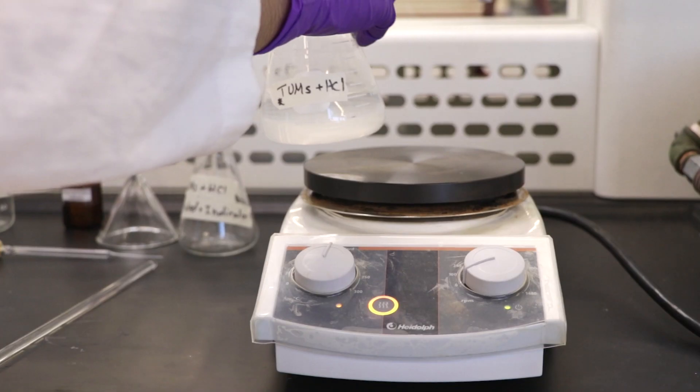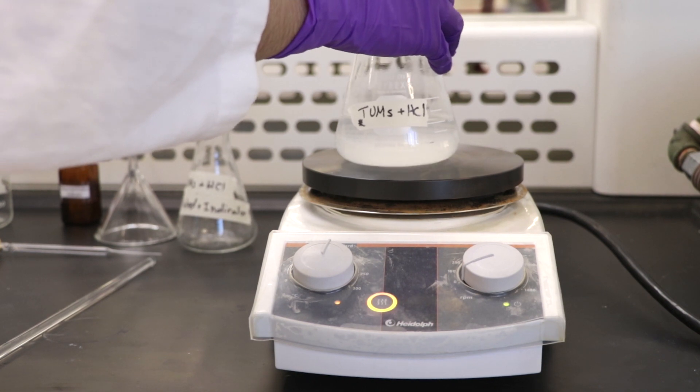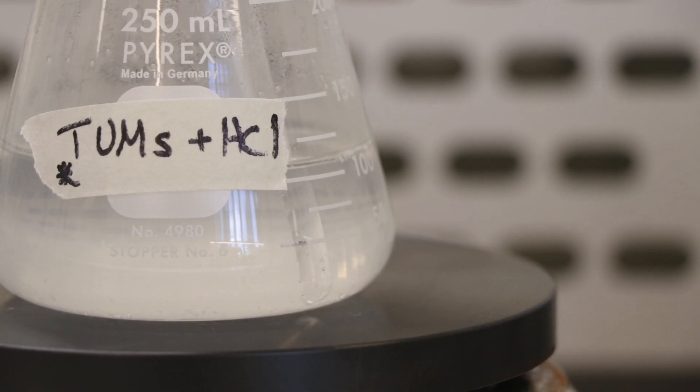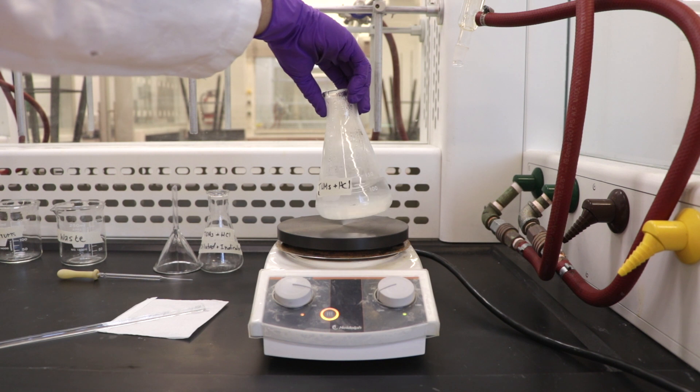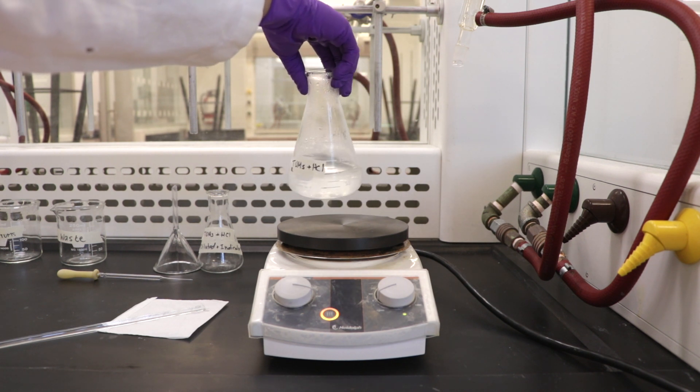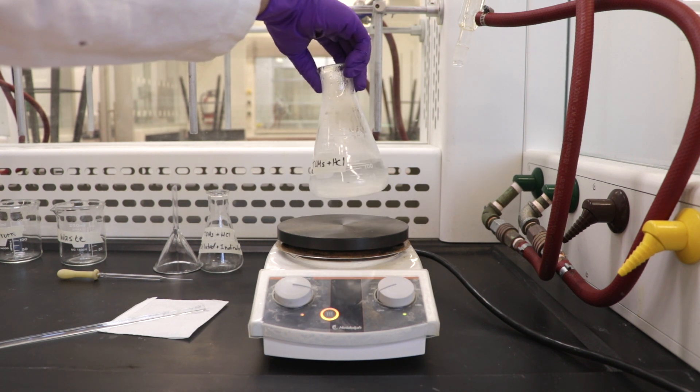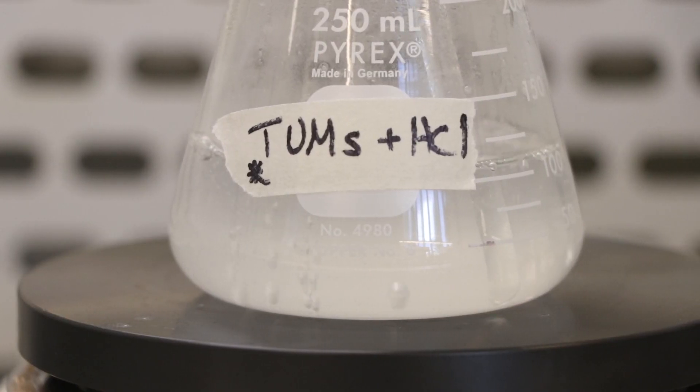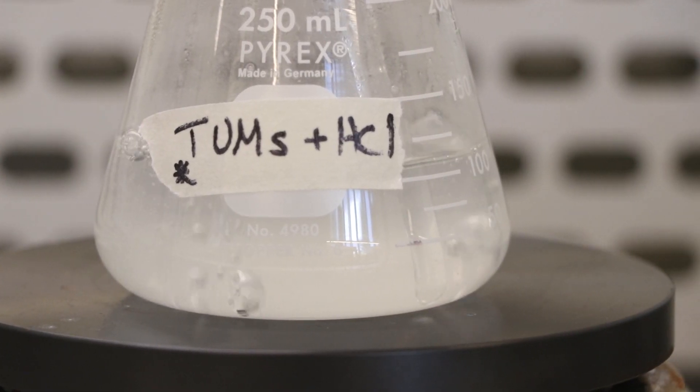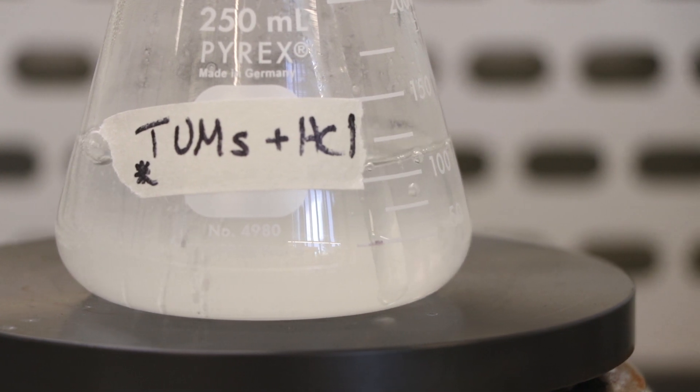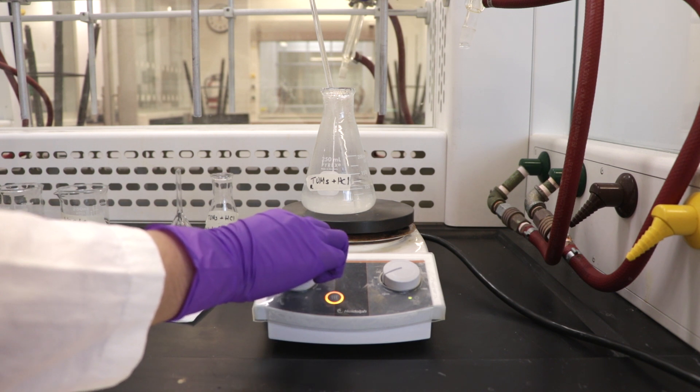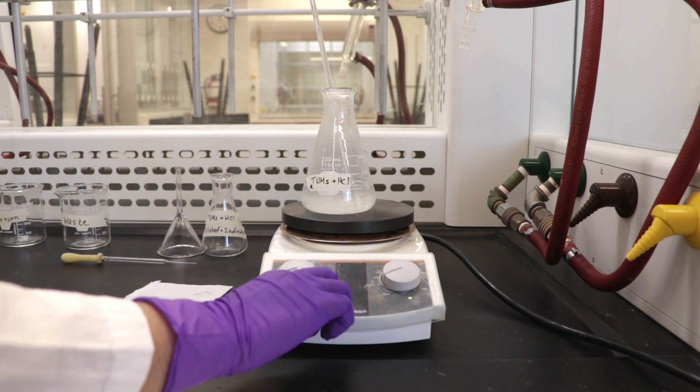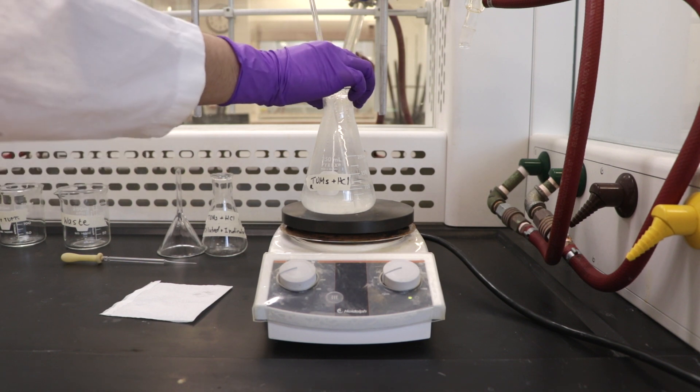Place the flask on the hot plate and heat to a gentle boil for five minutes to remove the dissolved carbon dioxide. Dissolve the tablet as much as you can. Try swirling the flask or breaking the tablet with a stirring rod. The tablet has insoluble binding material, so you may not be able to get everything to completely dissolve. If any film forms along the side of the flask, wash it down with a disposable pipette or a wash bottle. After five minutes of boiling, set the flask on the bench to cool.